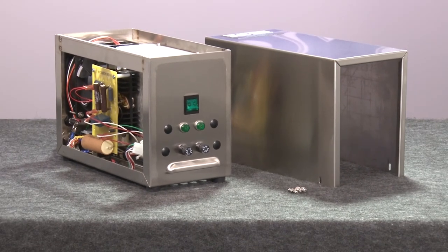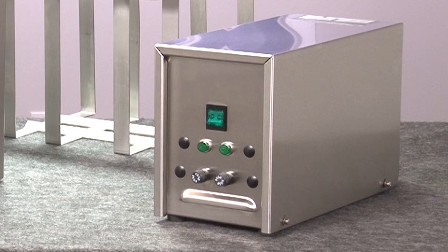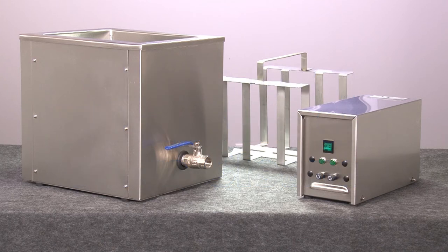Electronic circuit boards in the generator feature modular design for fast and easy servicing. The generator includes front-facing indicator lights and fuses to make the Gilson UB1 ultrasonic 8-inch sieve cleaner the right choice for your materials testing lab.